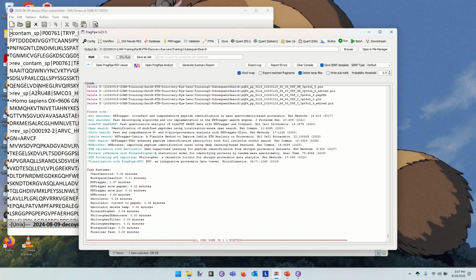Is it a bad experiment if you identify 10%? No. Not necessarily, yeah. It could be that you're dealing with a biofluid, and in a biofluid, identifying 10% of your spectra is still pretty good. Identifying half your spectra feels better, but that most typically happens when you have mixtures of proteins that are more similar in their concentrations and a great diversity of them.